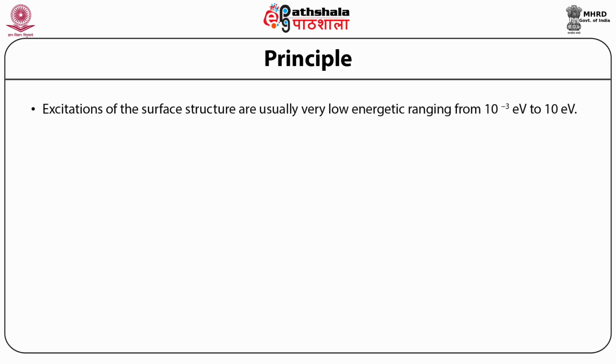Excitations of the surface structure are usually very low energetics, ranging from 10 raised to the power minus 3 electron volt to 10 electron volts.